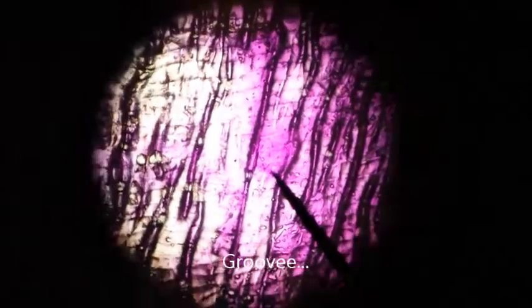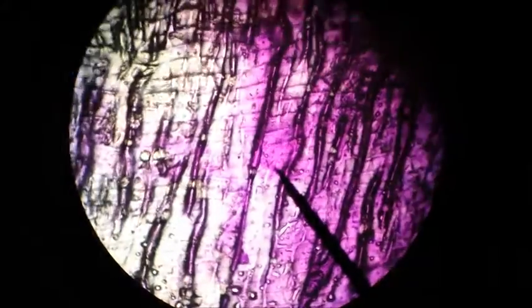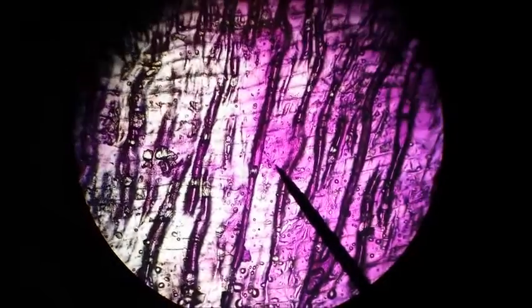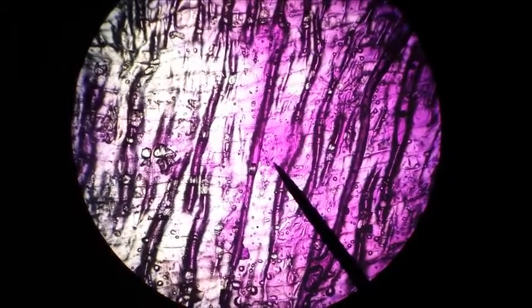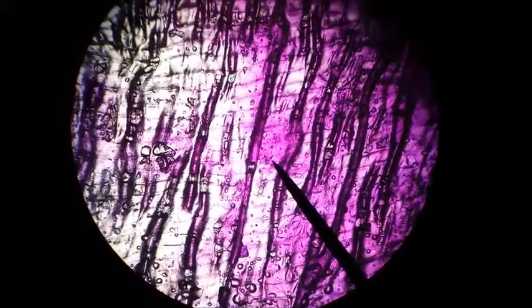But a beautiful slide, this just straight up looks what I would call groovy. So you can see the horizontal striations which are the cells in the onion, but the vertical ones are just wrinkles. So we really do take for granted the beautiful slides when we look at a prepared onion root tip slide.